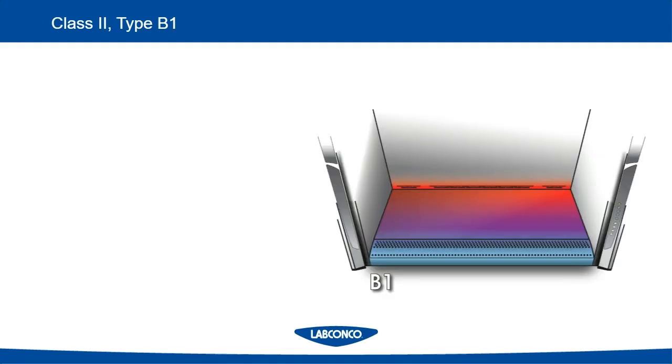Okay. This brings us to the next class of biosafety cabinet, and that's going to be the Class II type B1 and B2. Now, B1s are not quite as common as the Class II type B2, but I wanted to bring them up just in case you have heard of them. Now, in a B1 style cabinet design, a portion of the air is recirculated, like in the A's.